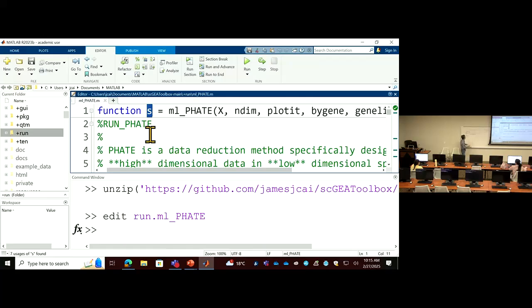Your output is number of C, C1, C2, Cn, that's the number of cells. So for each cell, you have either 2 numbers or 3 numbers.